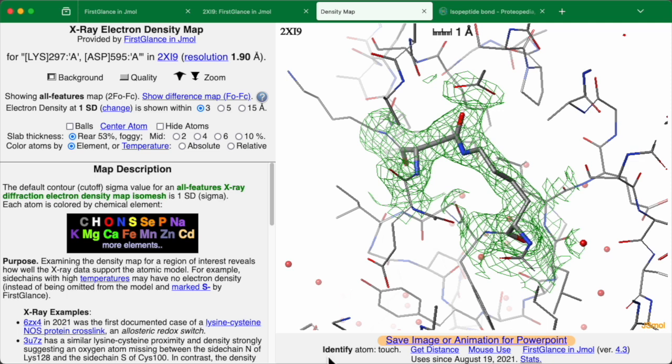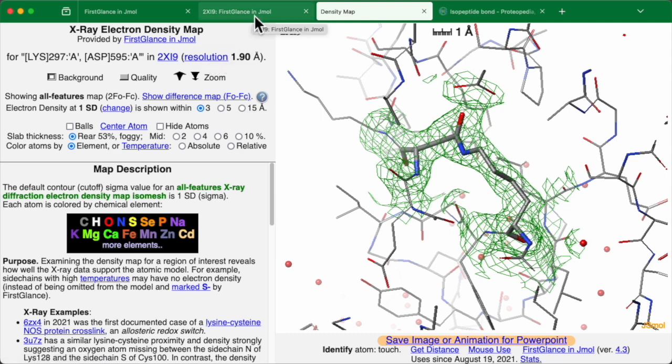If you'd like to review what resolution means for crystallographic experiments, just click on this link. And by the way, if we go back to FirstGlance, we see that it says here resolution 1.9 angstroms and characterizes it that many atoms will be clearly seen. If you want more information, click on this question mark.